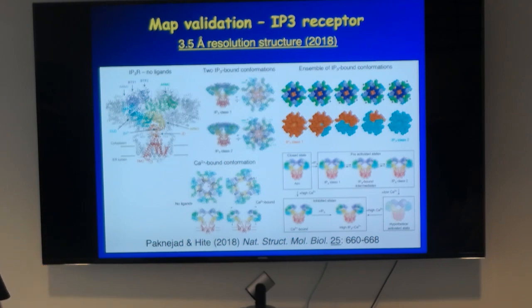So even when you do the mass spec analysis of cross-linked samples and you find all the different cross-links, only a few of them actually occur in each protein. So even if you cross-link, there might be proteins that are totally non-cross-linked and some that are heavily cross-linked. There's a mixture of all kinds of differences. So if you cross-link, you don't end up with one single species. It's still different species, more or less heavily cross-linked.